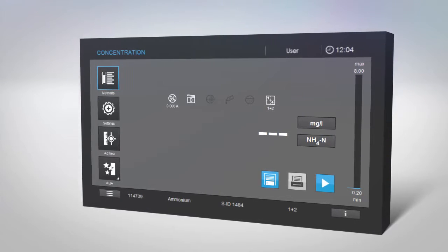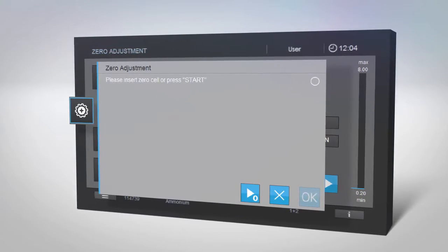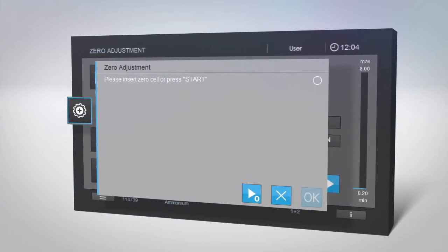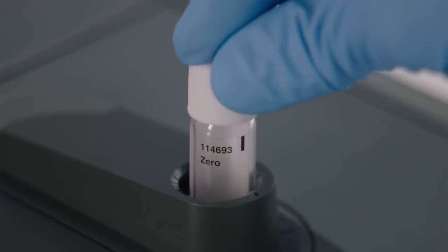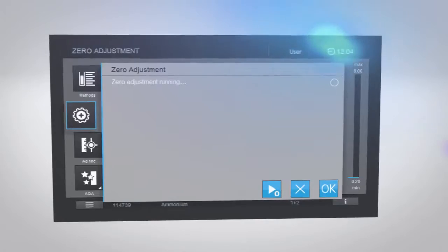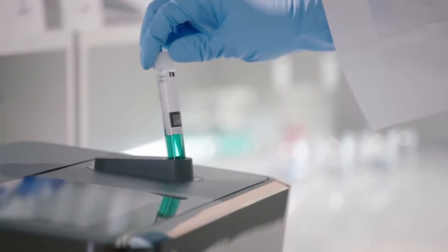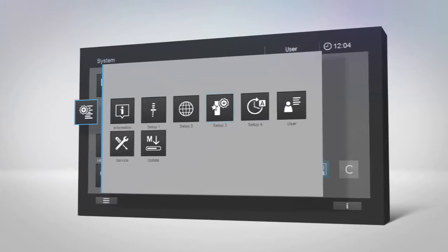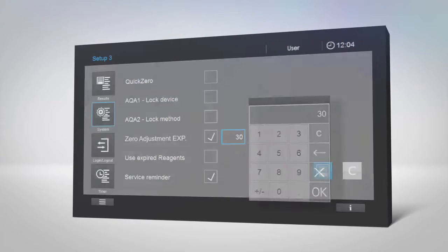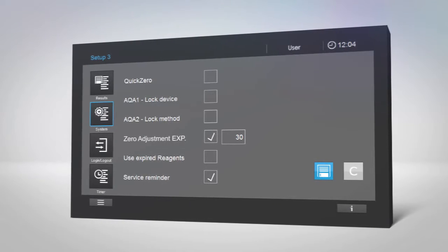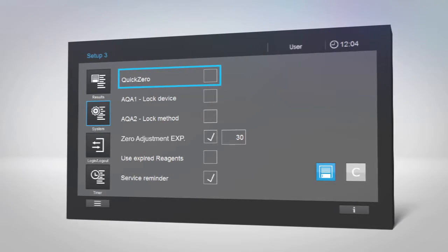When using a cell test kit for the first time, you will be asked to perform a zero adjustment. You will need the zero cell which was supplied with SpectraQuant Prove. Replacement zero cells are also sold separately. Insert the zero cell and the measurement will start immediately. Then insert your sample again. In Setup 3, the expiration time of the zero adjustment value can be entered manually. If you use various SpectraQuant test kits, the quick zero function will help you speed things up.